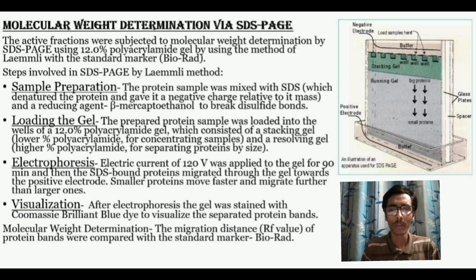At pH more than 5.8, it starts becoming basic in nature and becomes deprotonated, that is, it carries negative charge. Whereas at pH less than 5.8, it starts becoming protonated, that is, at acidic pH, it carries a positive charge. So, while separating until the stacking gel, whose pH is 6.8, the Cl- ions remain most forward, as it is most negative among the proteins and the glycine.